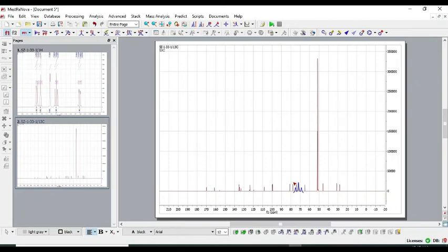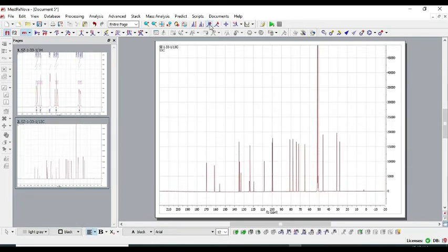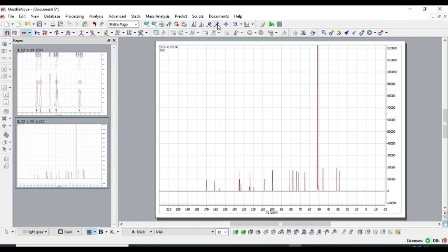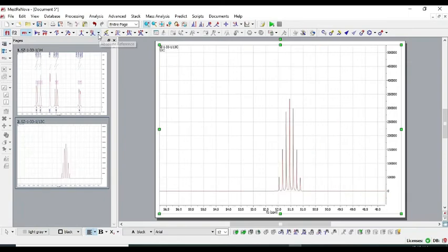Again, the peaks are pretty small, and you can see the carbon spectrum here, the carbon scale here. Here's the intensity. If you want to increase the intensity, again you can do it from here. So you can increase the intensity and so on, right? So this TMS signal is displaced from 0, so you can bring it to 0. If you go and select this peak, which is for the solvent, and then go to reference here and click on this and select the central peak.